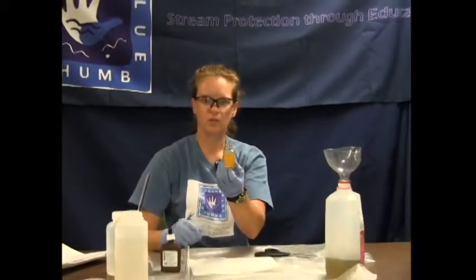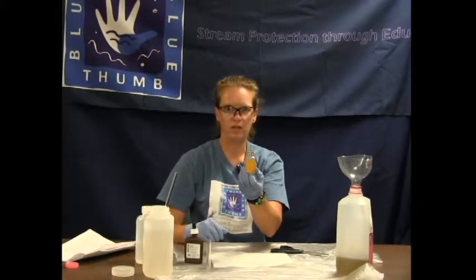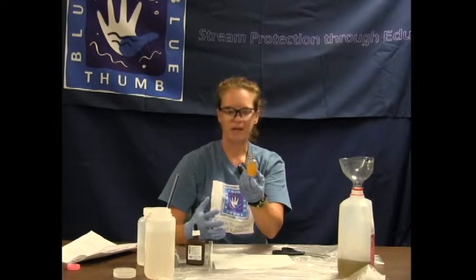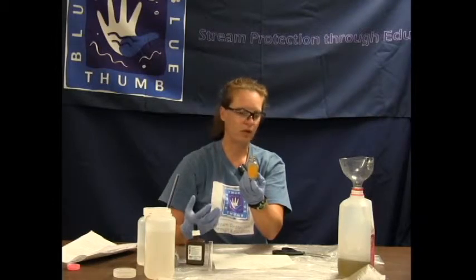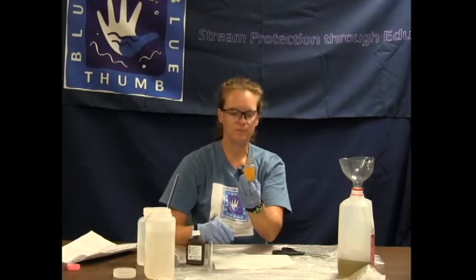Our first test had 20 milligrams per liter, this one had 25, and that is perfectly respectable for repeatability. On the chloride test you need to be within at most two drops difference to have repeatability. If you are more than two drops apart, do a third test and hopefully you achieve repeatability that way.